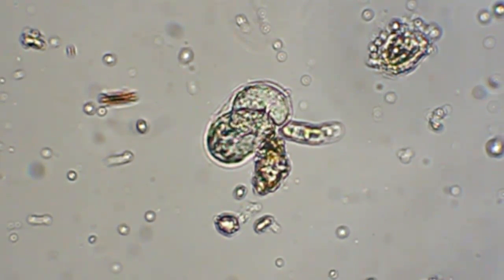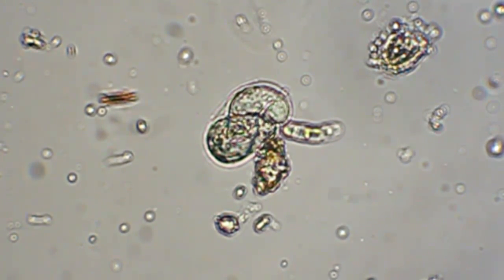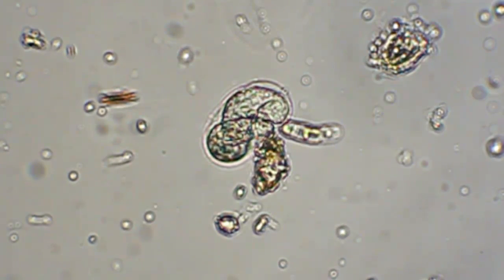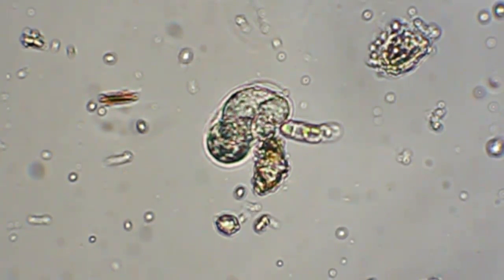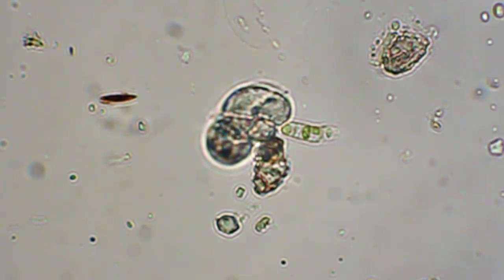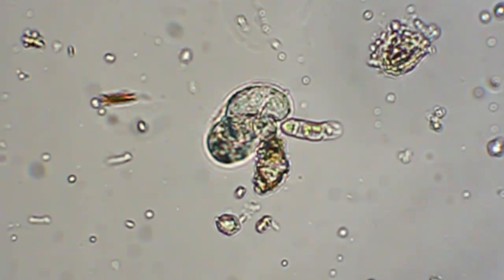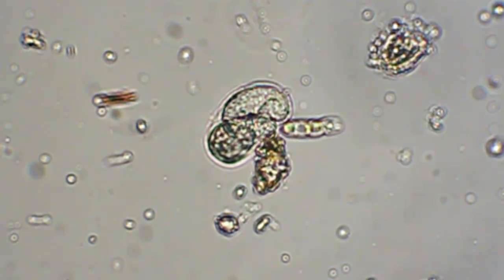It looks like some kind of helix thing inside there, but I can't really tell if it's one cell or several or what the heck it's doing in there. Maybe it's some kind of bug larvae, but still at 600 power it's pretty tiny for any bug.